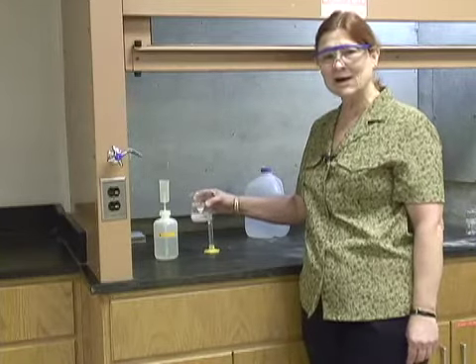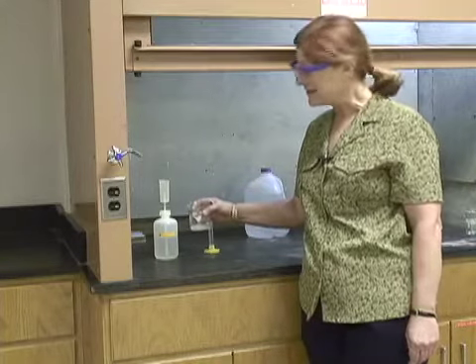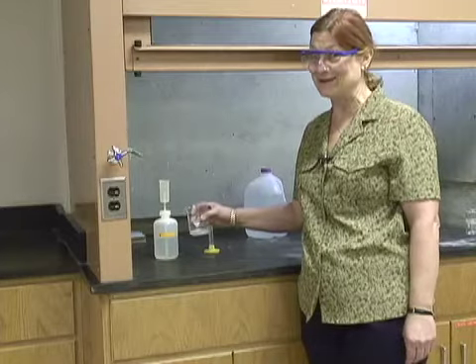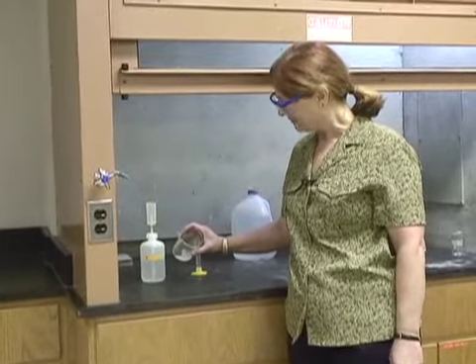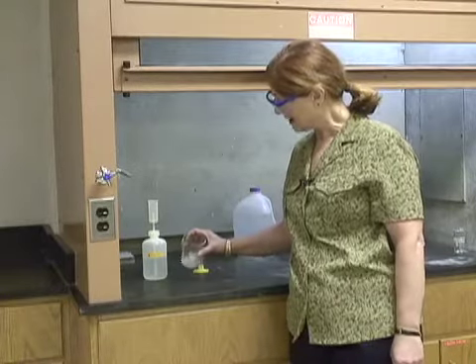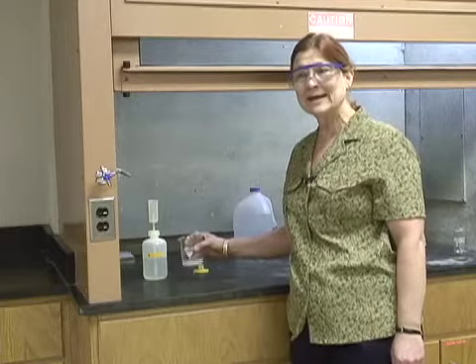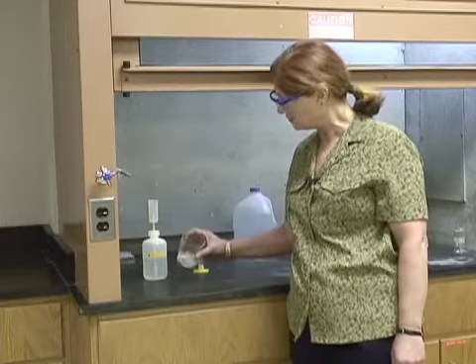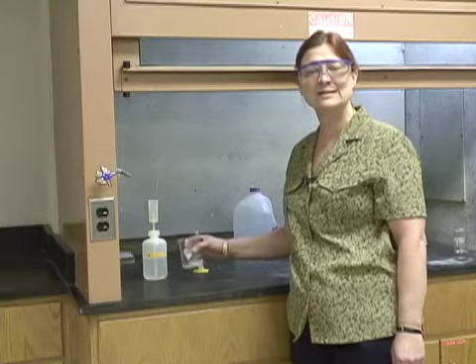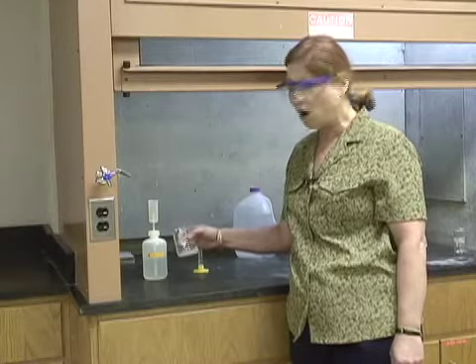It's not in our lab to interact with any Bunsen burner, because that's the next step. We do the Bunsen burner, and you know how excited I get about Bunsen burners, playing with fire. Under controlled circumstances, of course. Now I'm swirling it, and swirling it exposes those little particles to the acid and will increase the speed at which we can get it all to dissolve. And it must all dissolve.